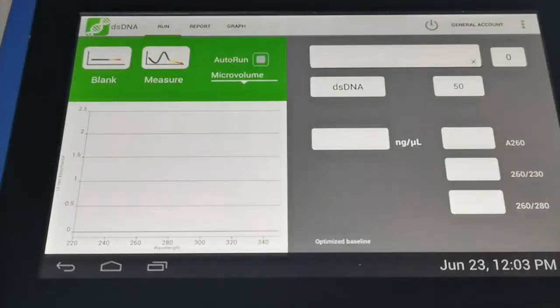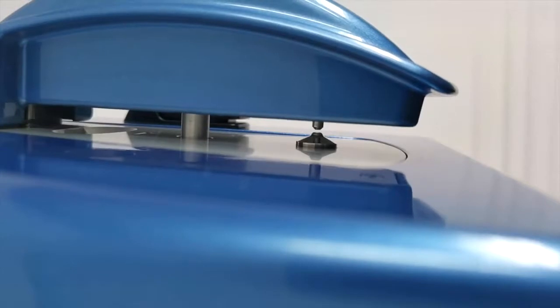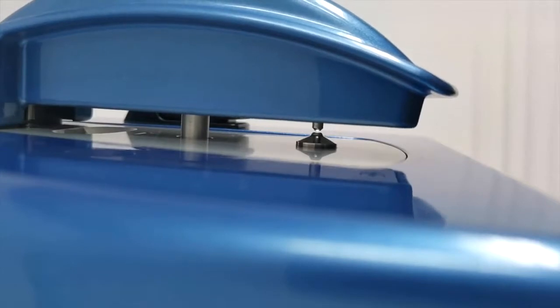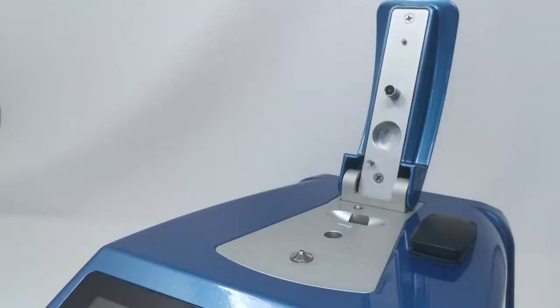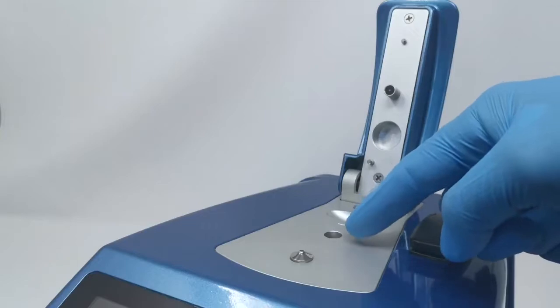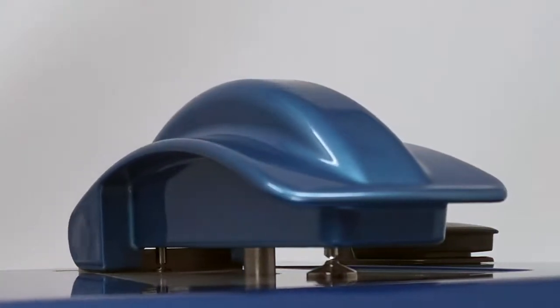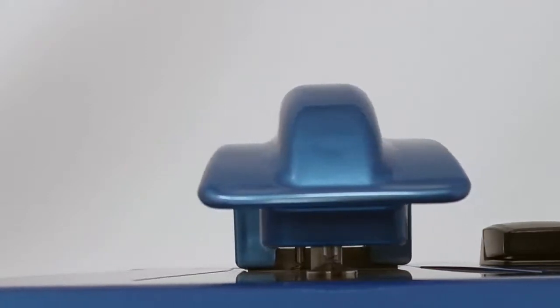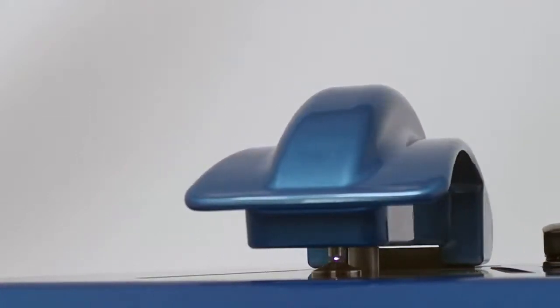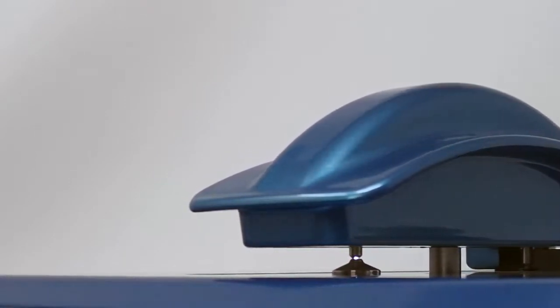And you'll see and you'll hear, as you start up any measurement app, it goes through an initialization. And what this does is the high precision screw that sets the path length, so it sets the height of the top measurement arm, goes through a routine where it finds its home position, and from that it can calculate any path length. So it knows exactly how many turns it takes to reach any particular path length. And this is a really key feature for the DS-11.